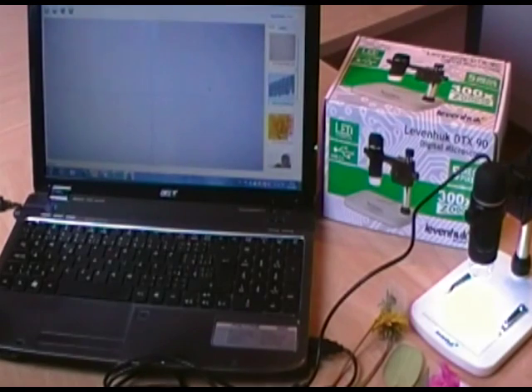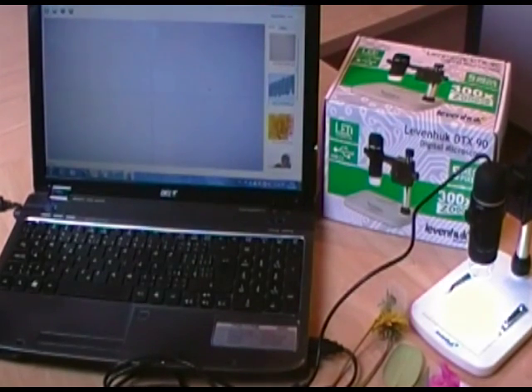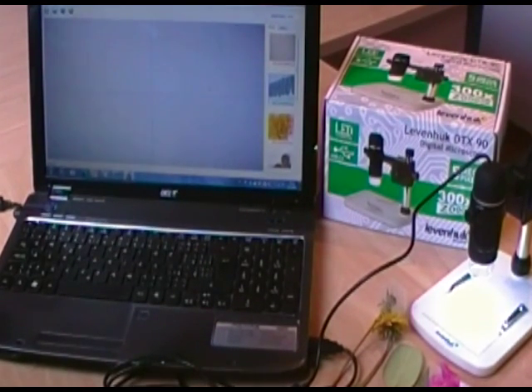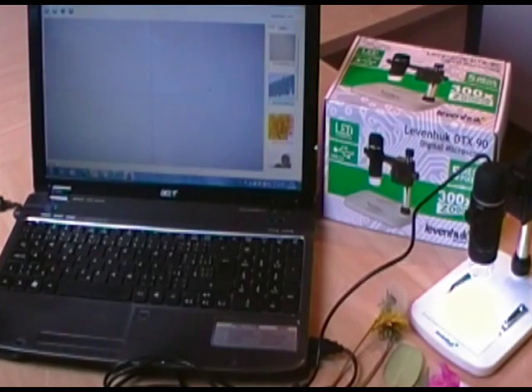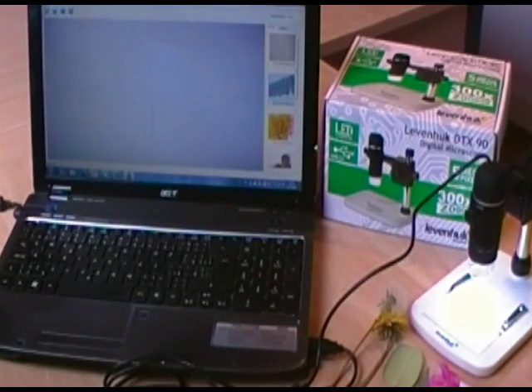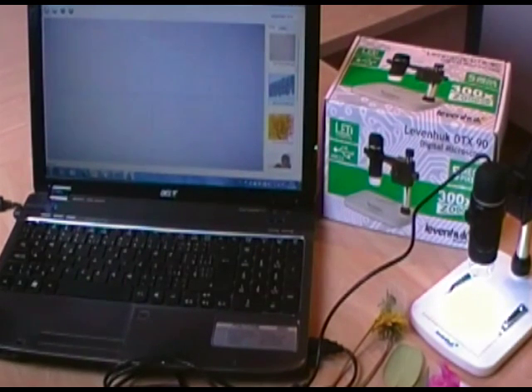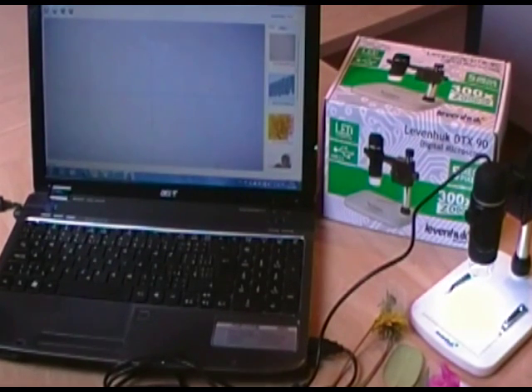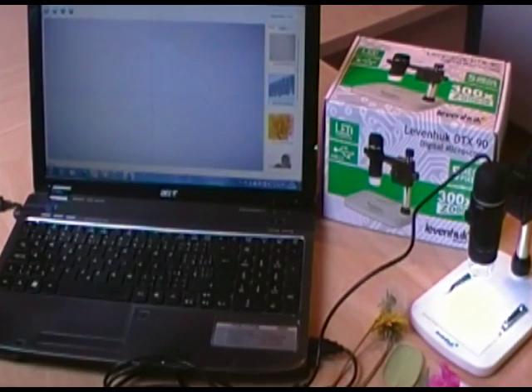Hello, I would like to introduce you to the Levenhuk DTX90 Digital Microscope. This is a digital microscope and I have prepared a presentation on how easy it is to use this microscope to magnify objects that I want to observe.